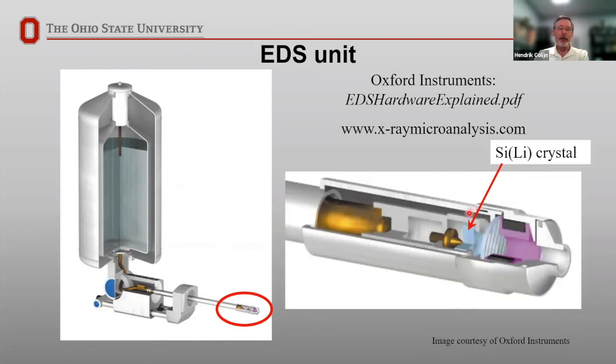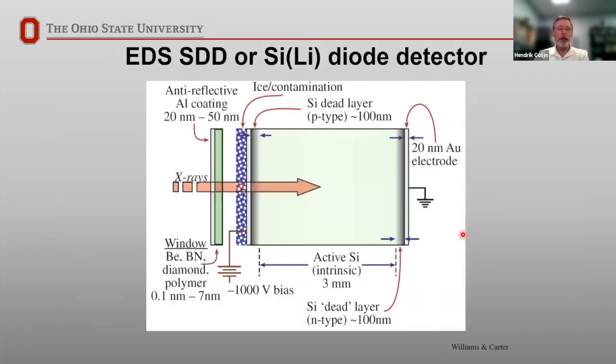So you had here a detector crystal that was maintained at liquid nitrogen temperatures. And they would put a window in front of it to keep it from icing up since it was so cold. So this crystal, in the older detectors, was a 3 millimeter piece of silicon.